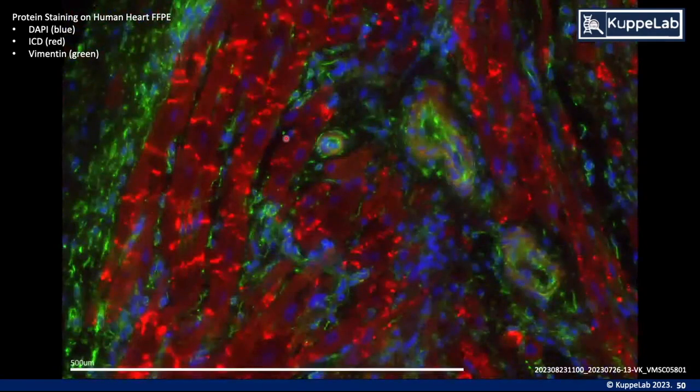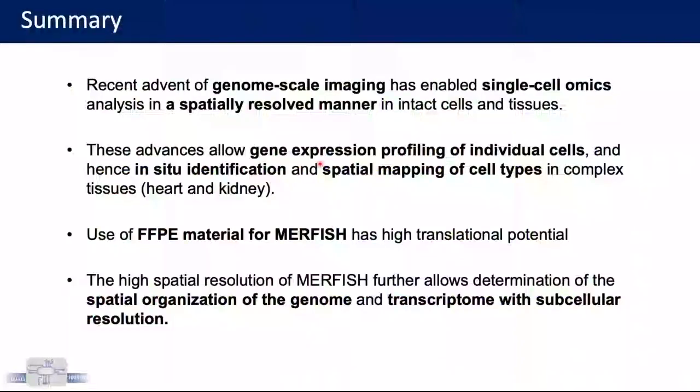And if we zoom in closer, you can see that using this antibody kit, we can nicely decode these cell-cell junctions between cardiomyocytes. Actually, these are gap junctions. And of course, this is data one can use for downstream analysis, also for segmentation purposes, like the vimentin staining.